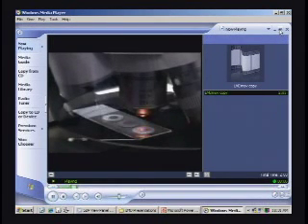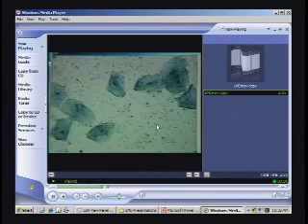Okay. So right now you'll see this light going on. Do you see that little blue mark in there? That's actually the laser hitting the sample. It's cutting. What's happening is it's going through the slide, cutting around where the membrane is, and the membrane and the sample are dropping into the tube. This is a poor quality video, I apologize. This is the speed at which the old instrument was working. The analyst is identifying the sperm cells and activating the laser. Then the laser is cutting around the sample, and the membrane will be falling down into the tube.